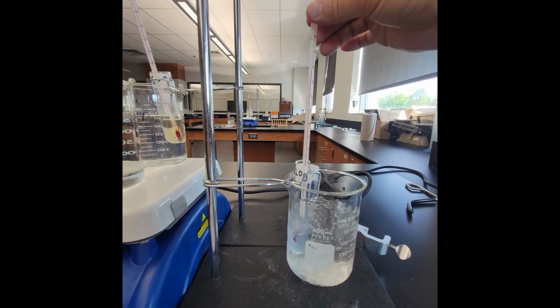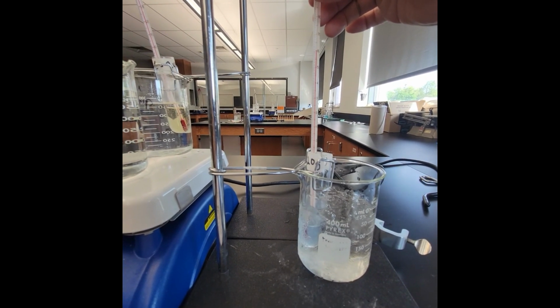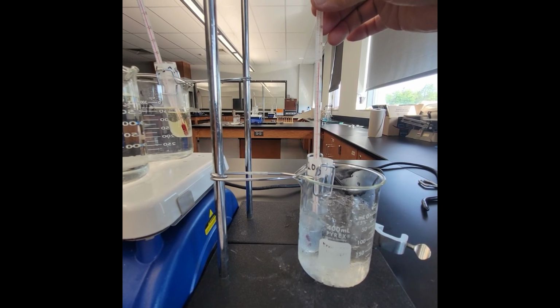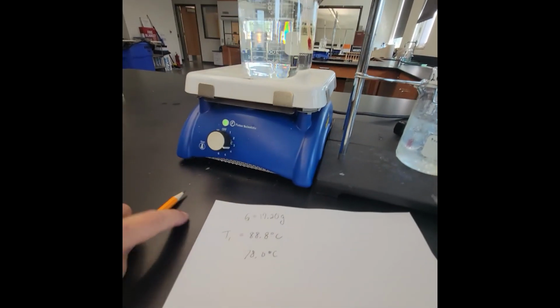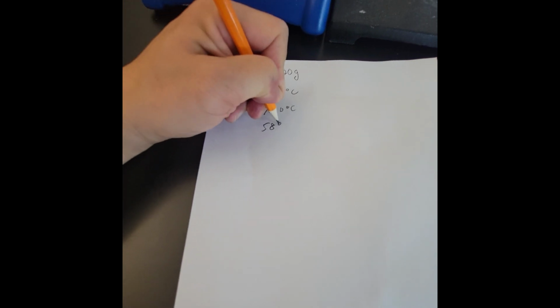I gotta make sure the chemical's fully submerged under the ice bath and my thermometer is submerged under the chemical without touching the sides of the test tube. So I'm already at 58. This may not be regular increments because I'm working by myself.